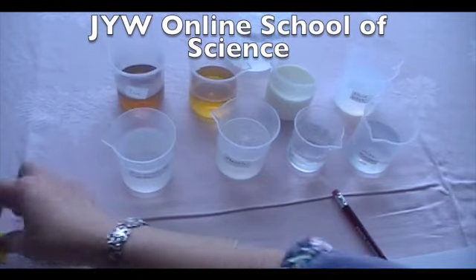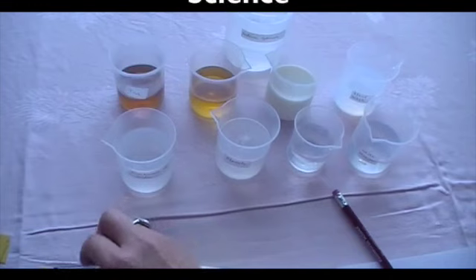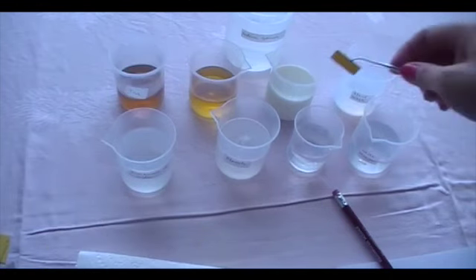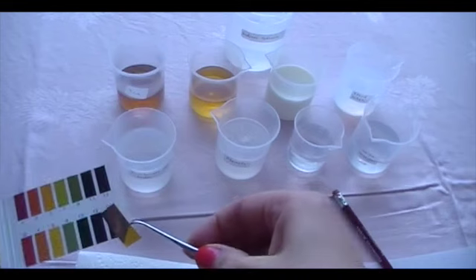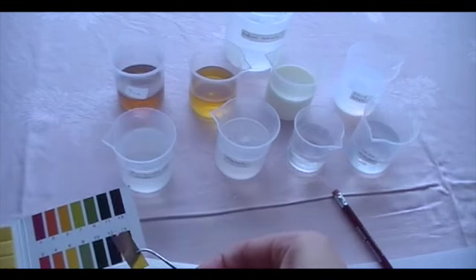Then we have a look at the next one. This is bleach. See the bleach? The color is mostly like pH 12.